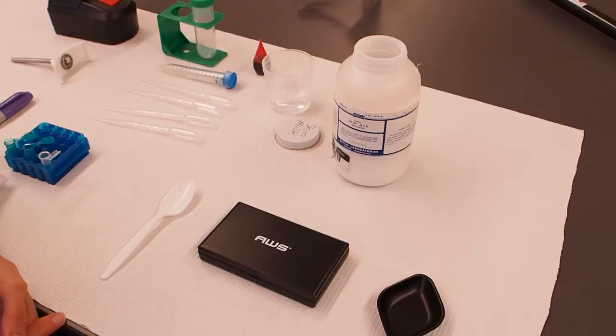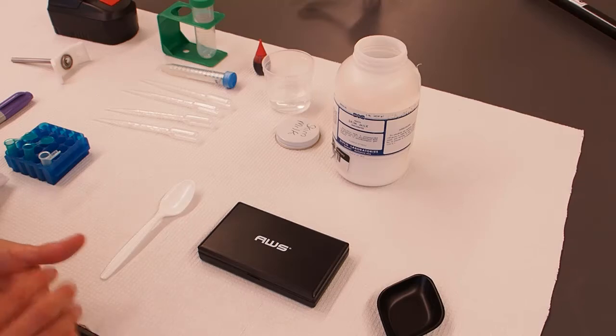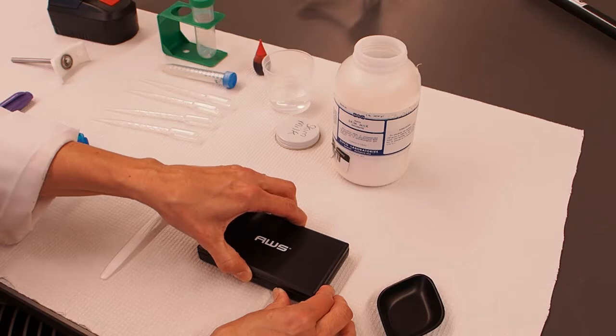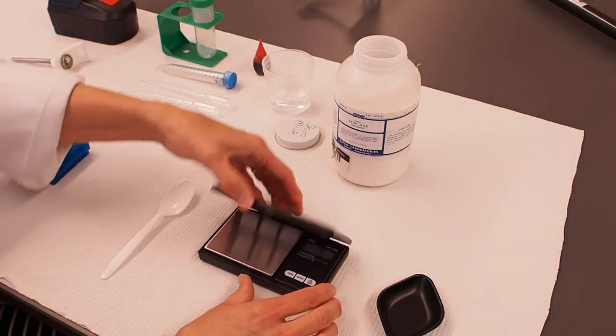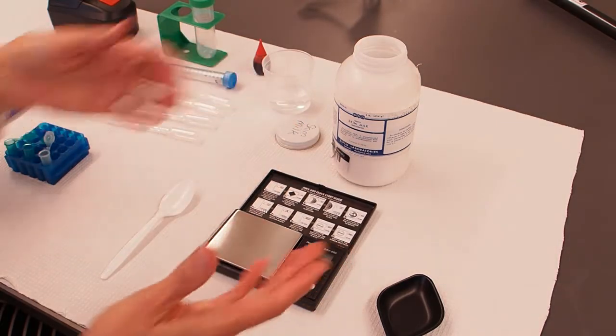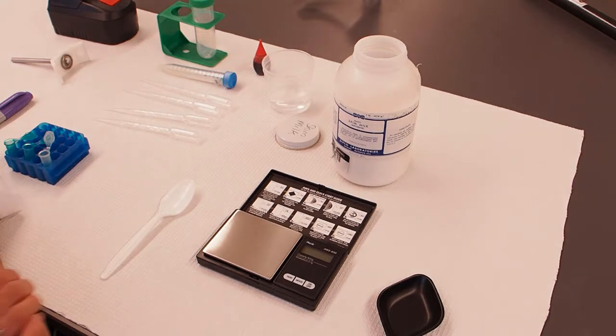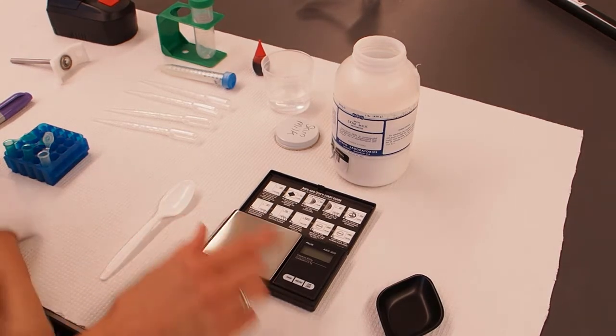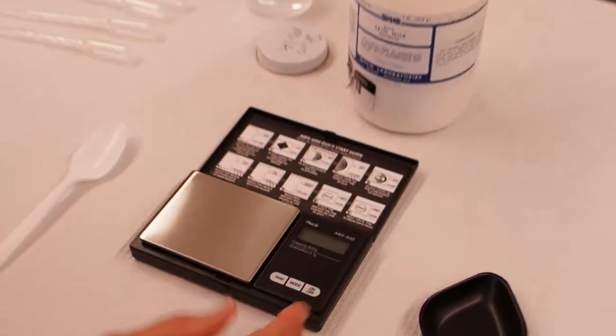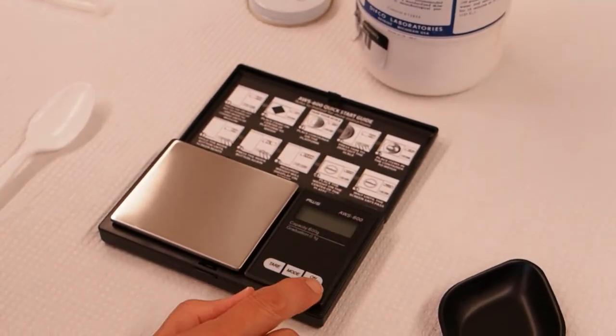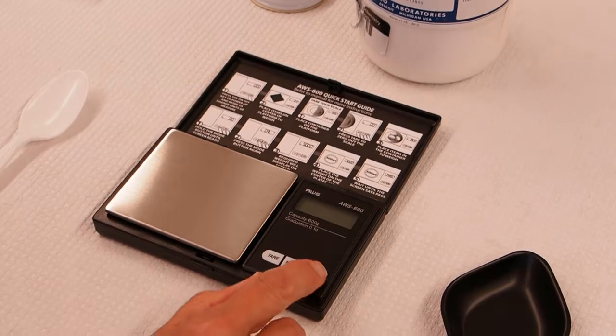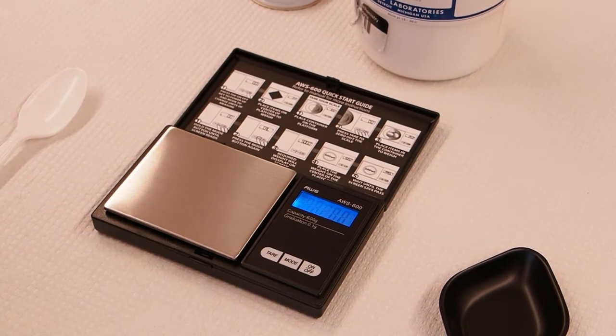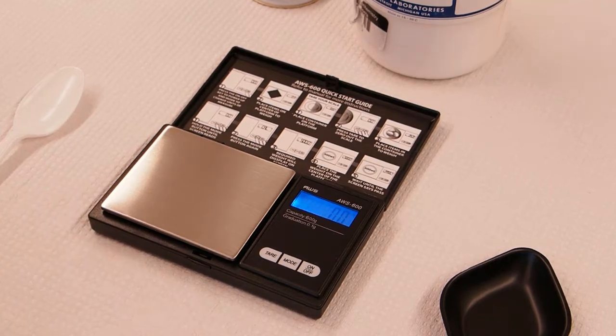First I'm going to show you how to use your scale, and you may hear us call it a balance. Scientists tend to call their scales balances because old fashioned scales used to have two pans that would balance when you were weighing things that were equal. If you open the cover of your balance, you'll see there's a display and some buttons for controls. You're going to hold the on off button to turn it on and wait till it reads a mass.